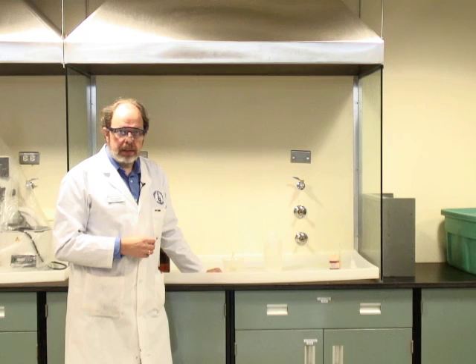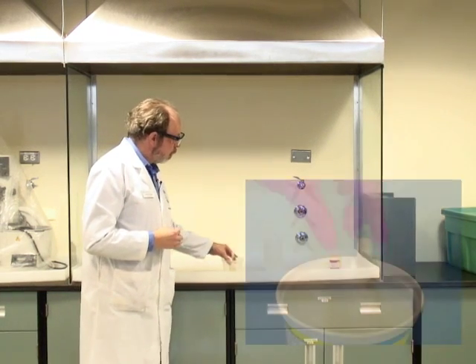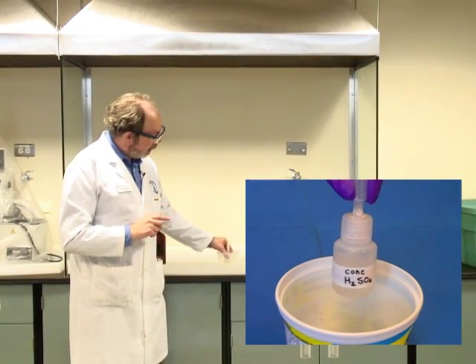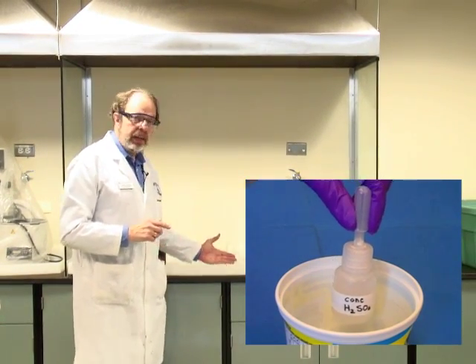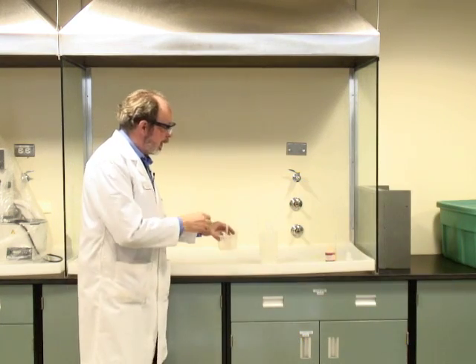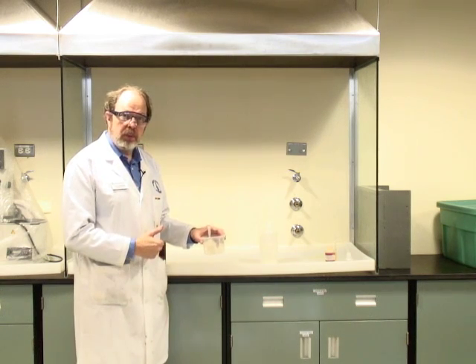When you have a hazardous chemical being dispensed, please take care with how you're doing the dispensing. Here we've got some concentrated sulfuric acid inside a dropper bottle. It's inside a container which is in turn inside the tray in the fume hood. Don't bring it out and dispense it out here — gravity being what it is, it will fall on the floor.